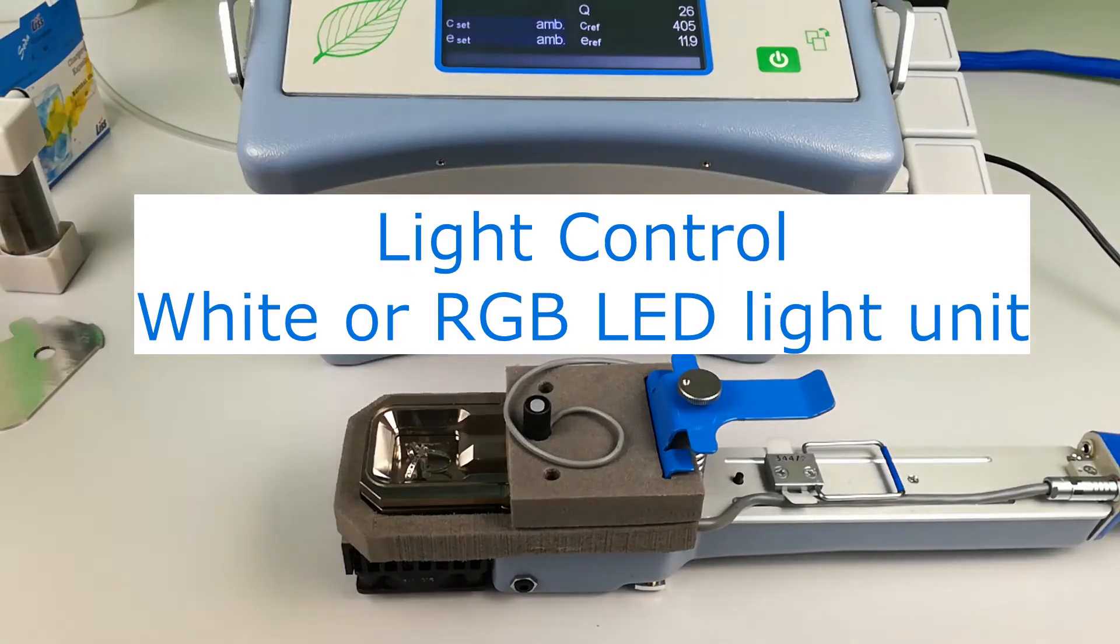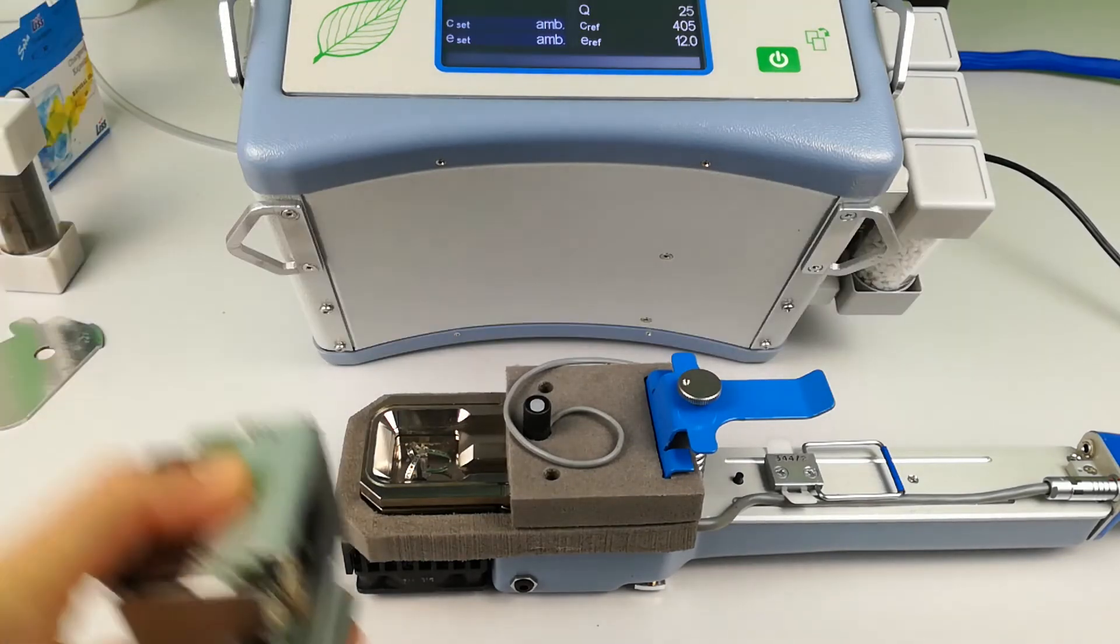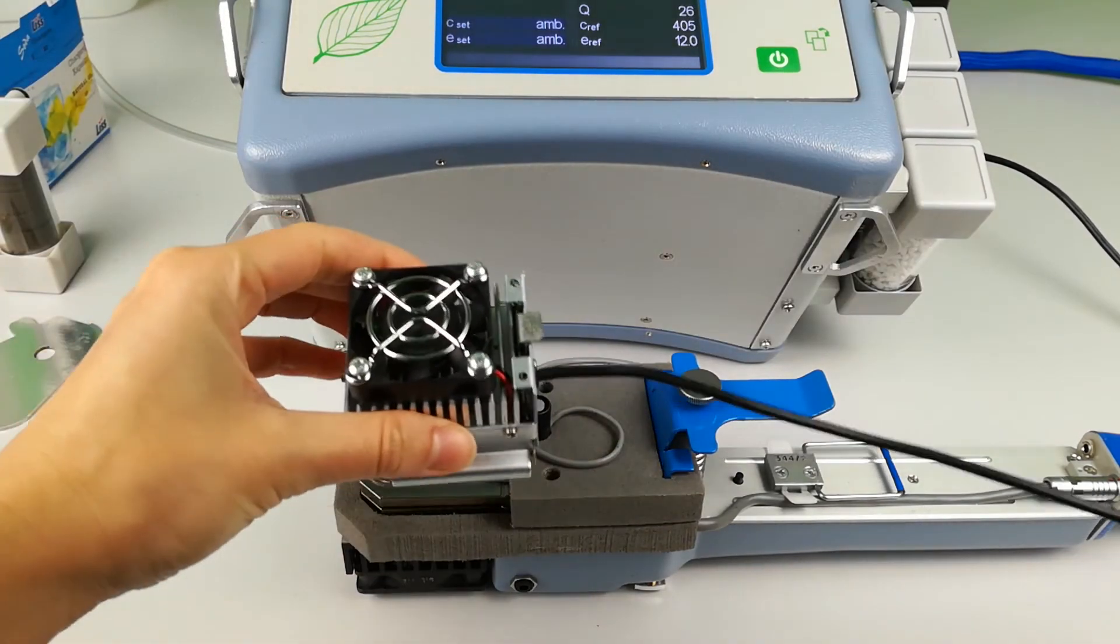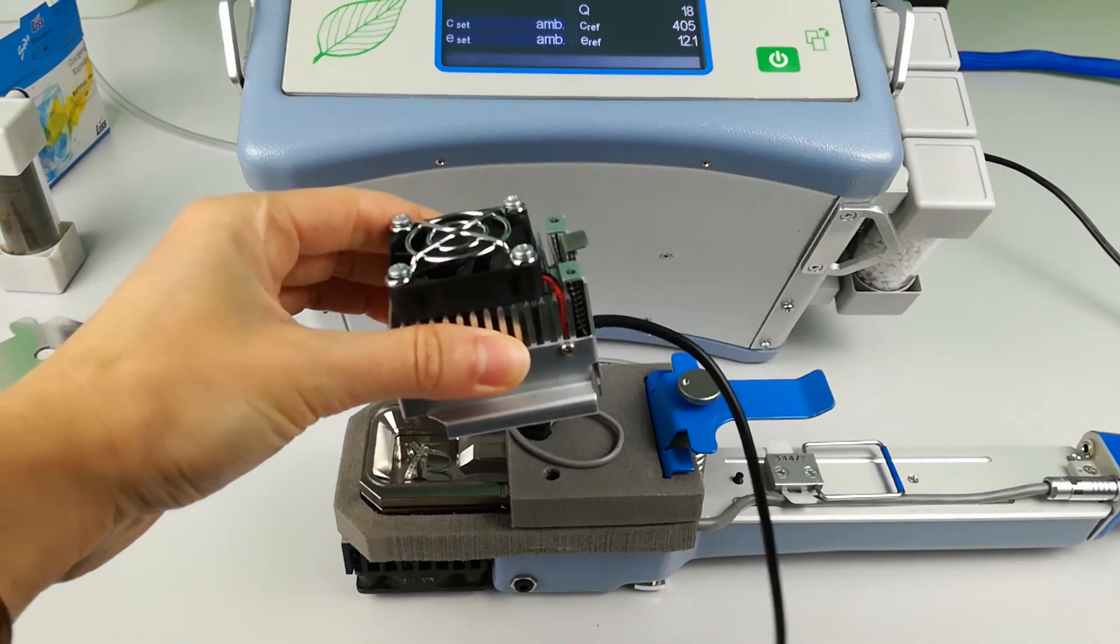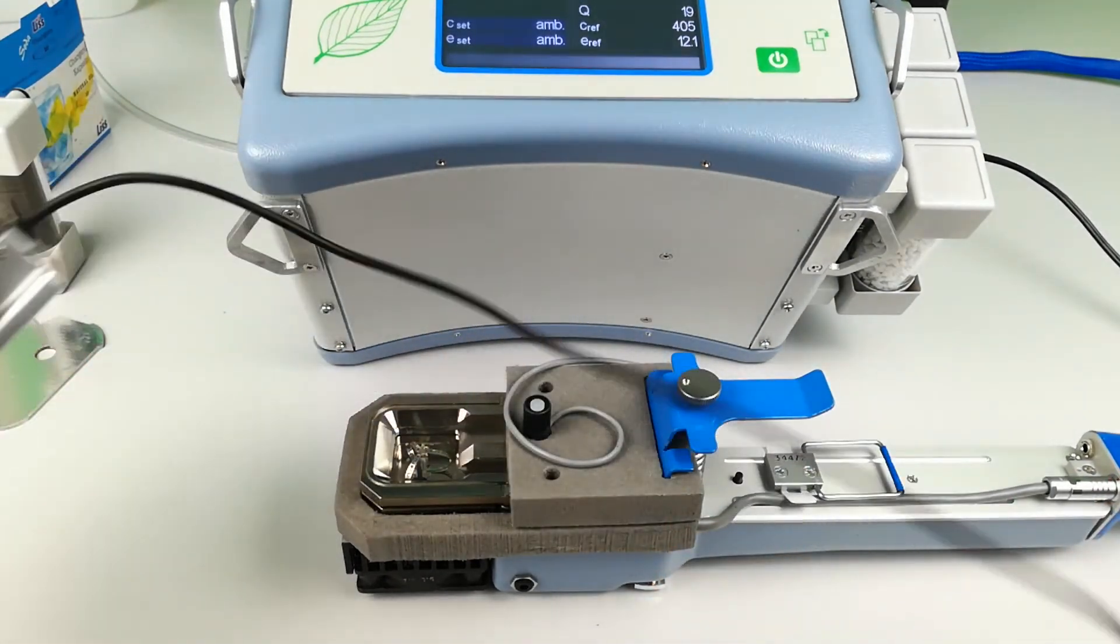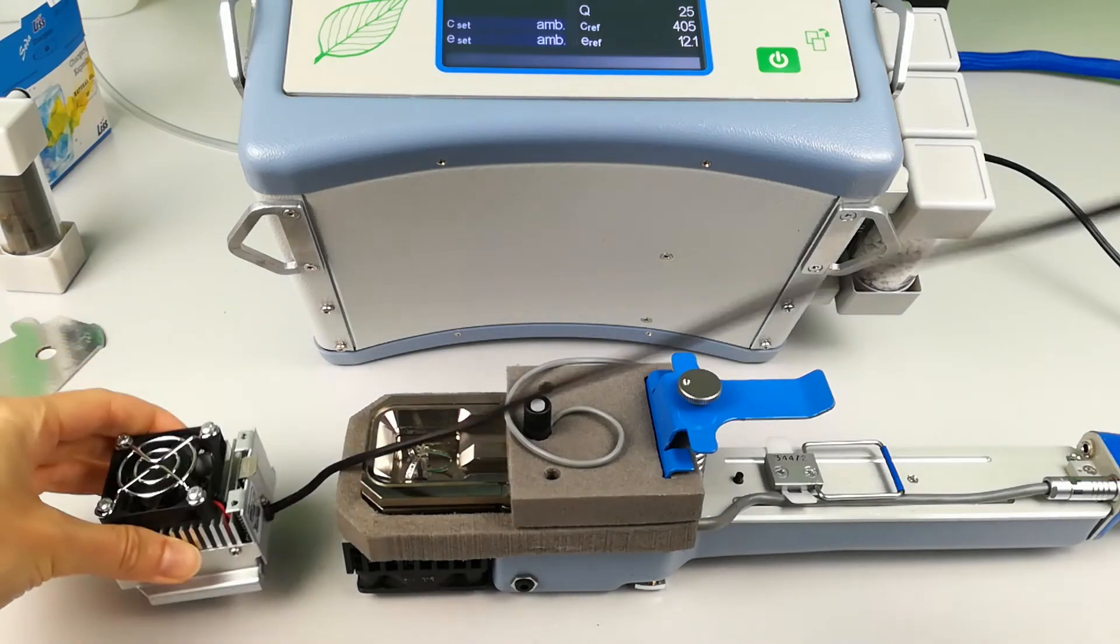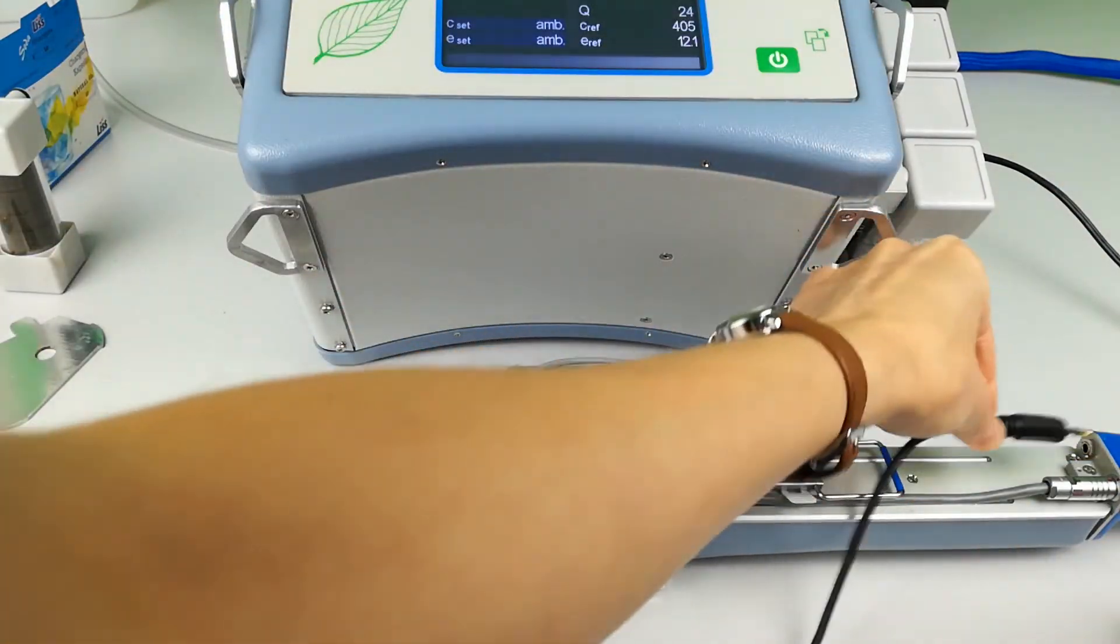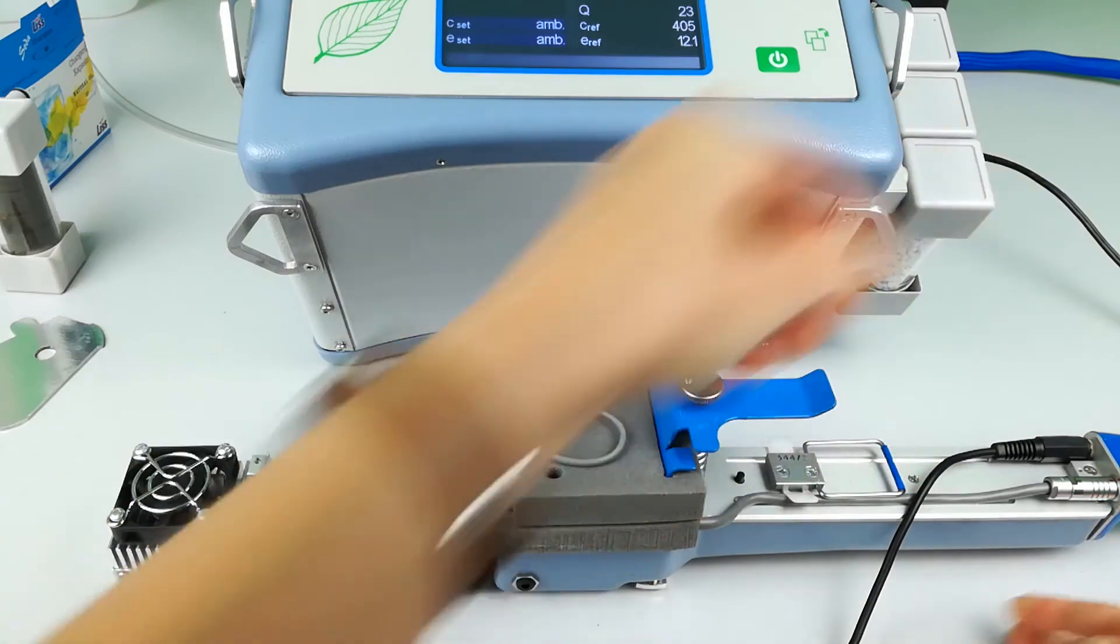Light control by white or red green blue LED light unit. LC-PRO-T is supplied with one light unit, either white or RGB as standard. Both options can be purchased. Connect the light unit cable into the handle socket.